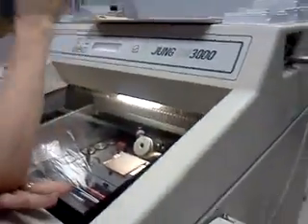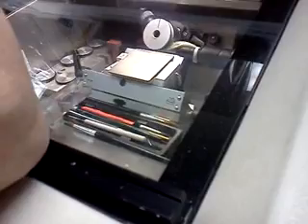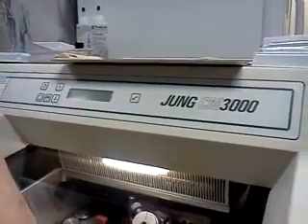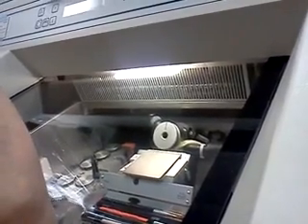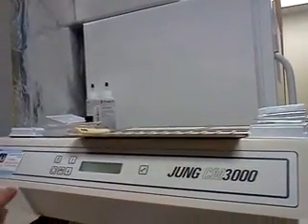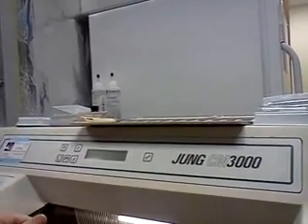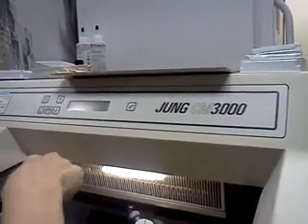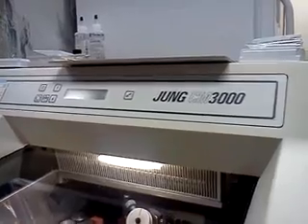Okay? So, rather than do all the labeling, you're going to have to get your block in there, and it's going to have to get to the temperature of the instrument. Remember, it's only at minus 20 in there, or it might be minus 80 if you get it out of the minus 80. So we want it to get to the temperature that's in here. That's going to take about a few minutes. Plus, you're going to have to glue it onto that chuck holder with OCT compound. It's going to have to freeze on there, and that's how it sticks on there so that it won't fall off when you're cutting. So best to get your block out, let it freeze, label your slide. By that time, that's ready to go.